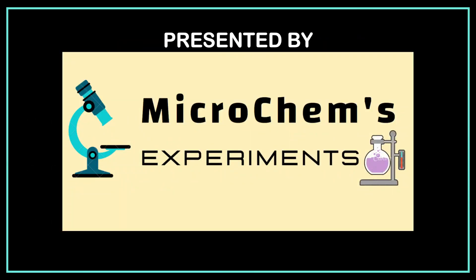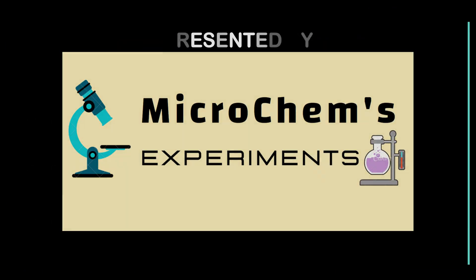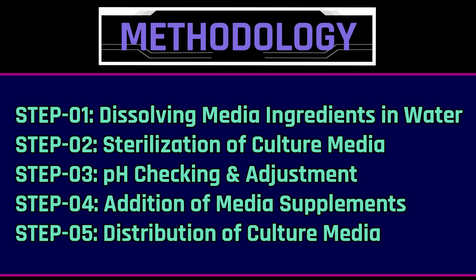Welcome to Microchem's experiments. We can prepare culture media following five steps: dissolving media ingredients in water, sterilization of culture media, pH checking and adjustment, addition of media supplements, and distribution of culture media.